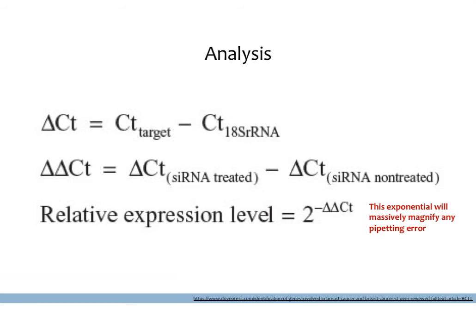So let's say that you have your 3 samples. So this is DMSO, replicate 1, 2, and 3. And this is for your GAPDH primer. And then you have DMSO 1, 2, and 3, and this is for your P53 primer. And now you want to calculate, so this was CT values, right? And you want to calculate expression.